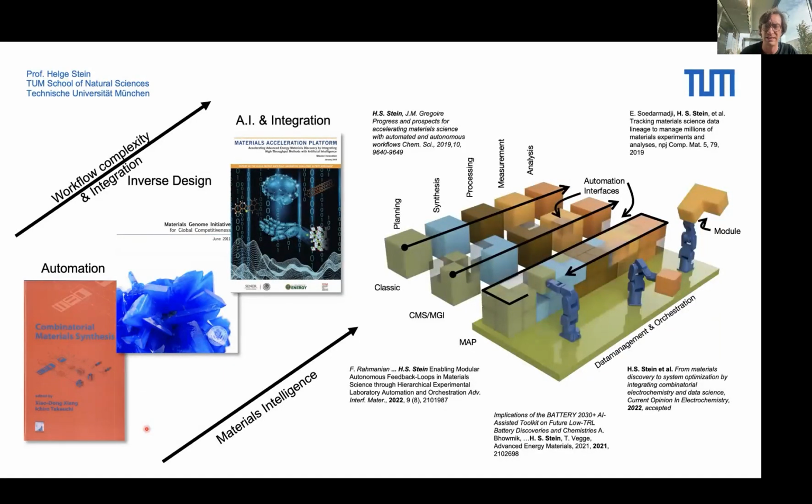What we actually need to view this as, in my opinion, is more like a platform where we have modular things, and it's not super fixed in terms of your workflow design. In the future you need to be able to have workflows that are completely modular. While you're doing something and you realize, okay, I need additional data, or I don't need certain data that I'm usually taking, you need to be able to kick stuff out of your workflow so that it becomes a little more fluid. And then I actually think we're in this paradigm shift of trying to maybe even one day answer the so-called Nobel Turing challenge.